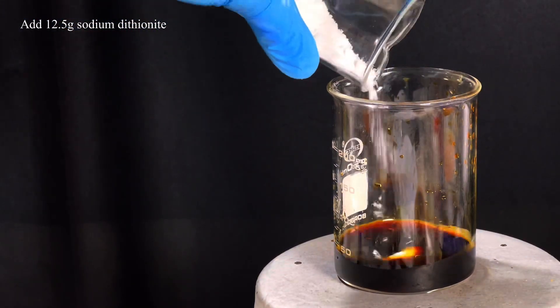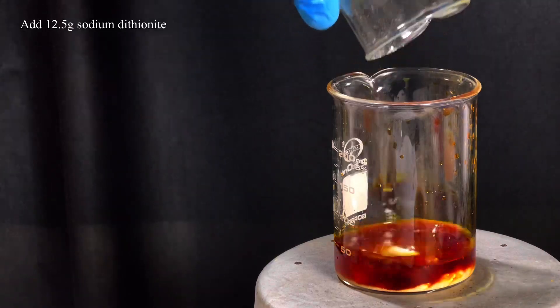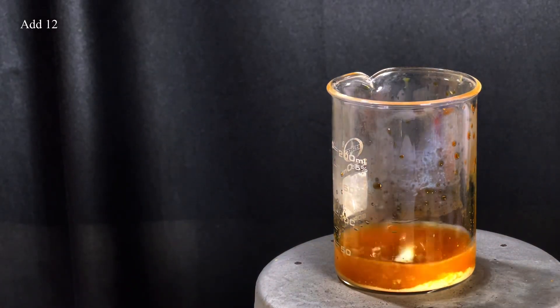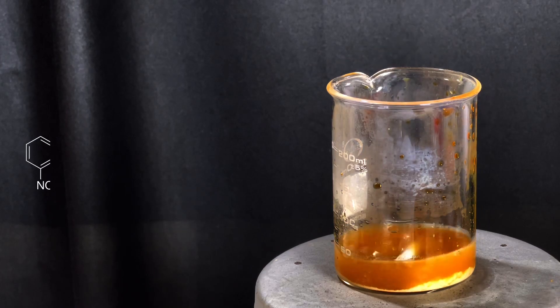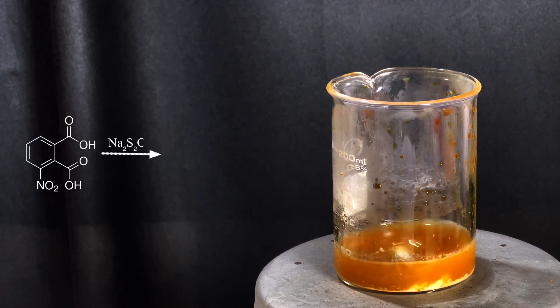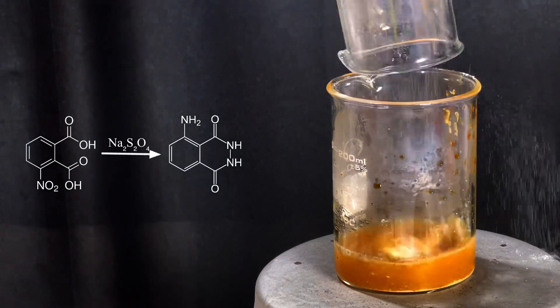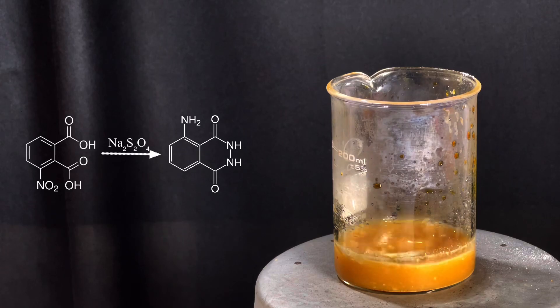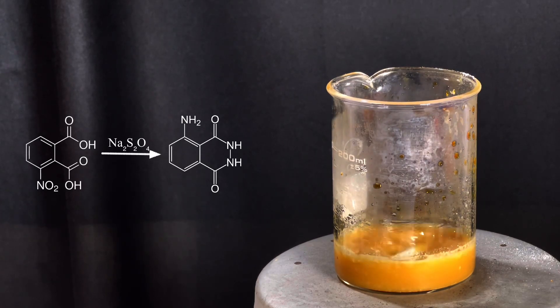Now we dump in 12.5 grams of solid sodium dithionite to the beaker. Immediately you see an exothermic reaction taking place and the color of the solution turns pale brown and a precipitate appears. This is the 3-aminophthalhydrazide or luminol. Sodium dithionite reduces the nitro group of 3-nitrophthalhydrazide to form luminol.